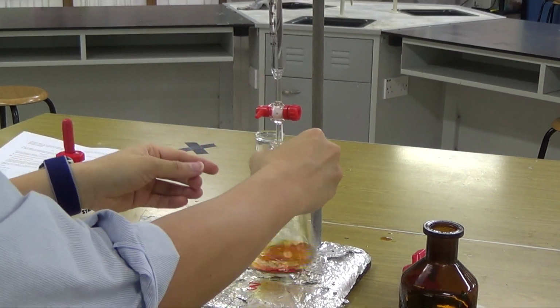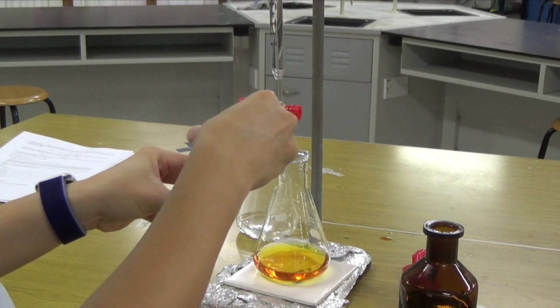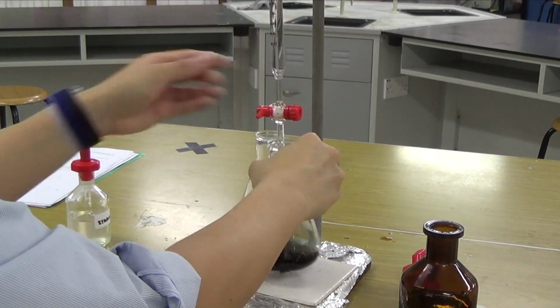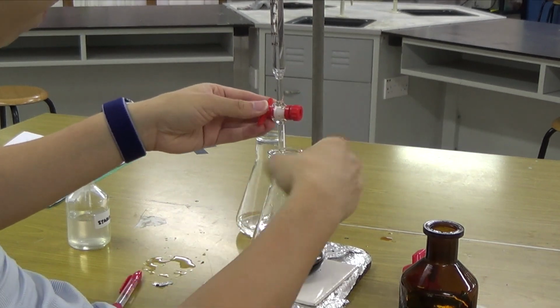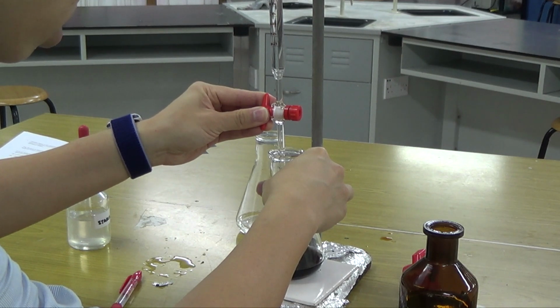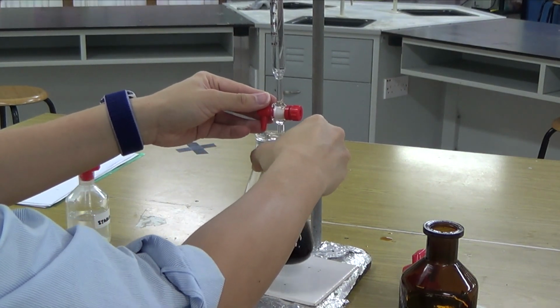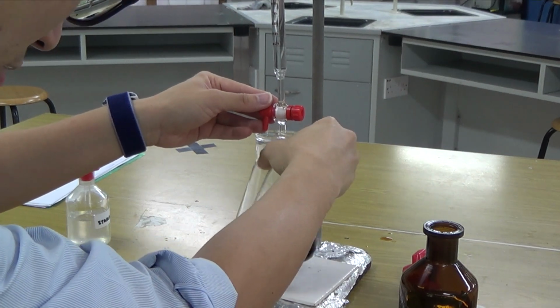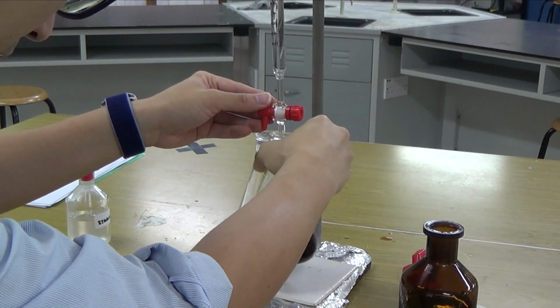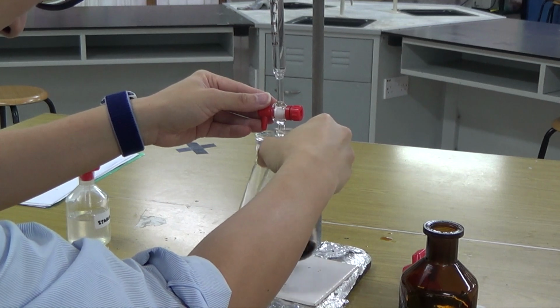Okay, so it is still a bit yellowy solution because there's still some iodine left in there. What I'm going to do is add the starch indicator. And here's where I need to be careful and do it drop by drop. So get your drop by drop, really drop by drop. It's going to take practice and time. It will be slow, but you want to be as accurate as possible. So you don't go full speed. You just swirl gently. Doesn't take much, I think. It is slow, very slow actually.